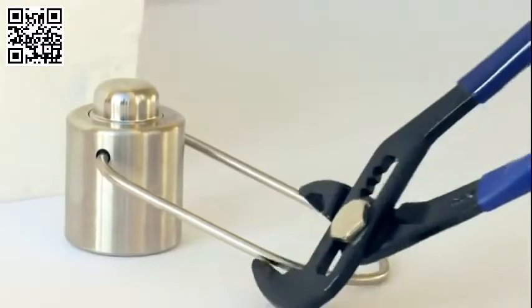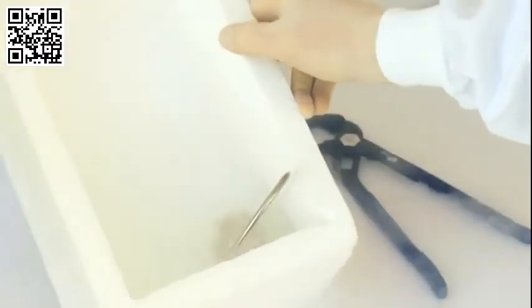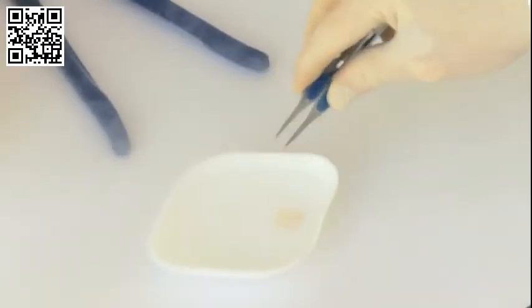The device is lowered into liquid nitrogen and allowed to cool. The transition from room temperature to liquid nitrogen temperature takes approximately 3 minutes. The sample, in this case a piece of cartilage, is also cooled in liquid nitrogen.